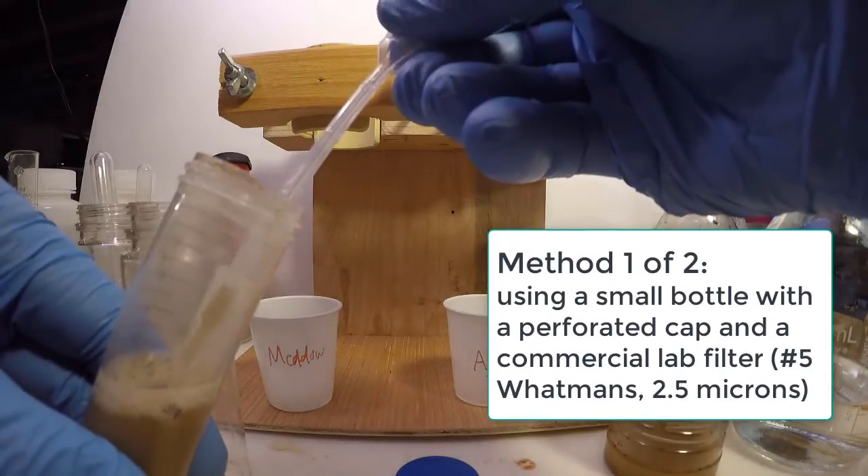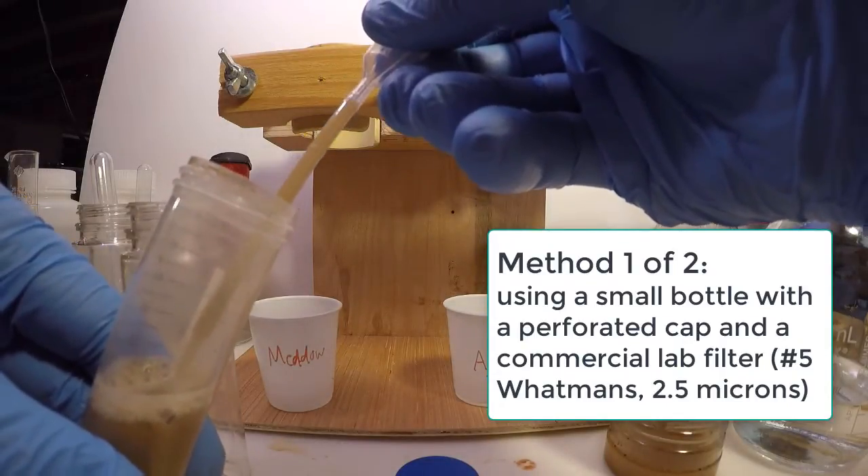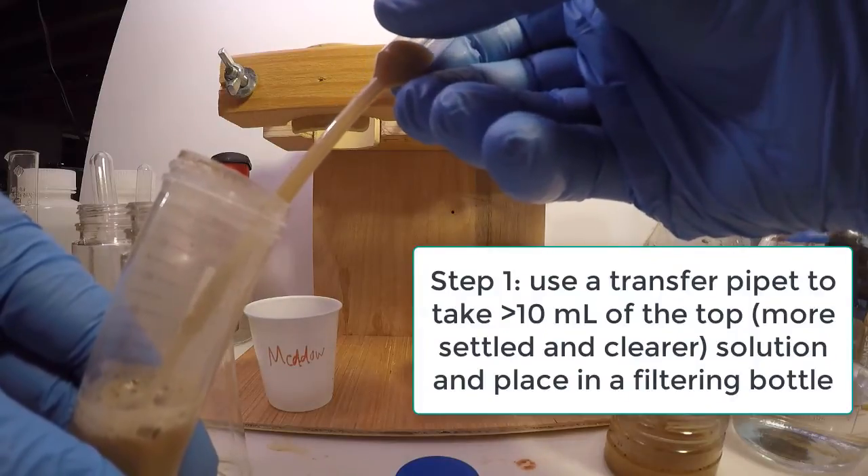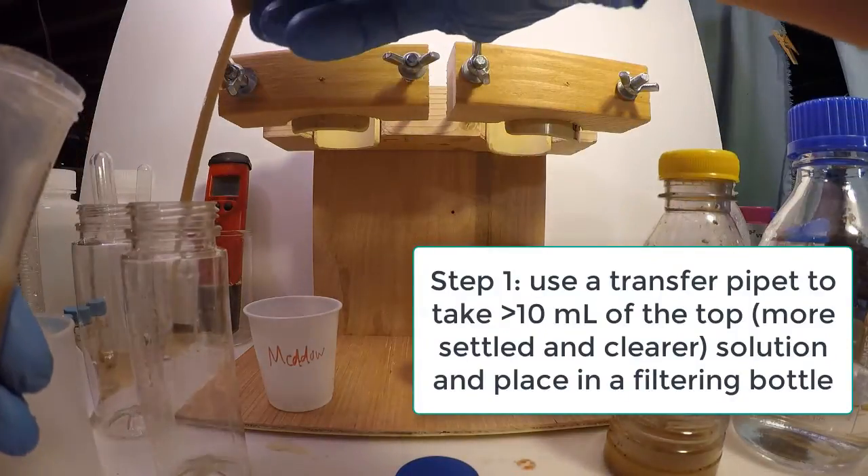To begin the first filtering method, we use a plastic pipette to transfer somewhat more than 10 milliliters of solution from the upper part of the bottle to a second bottle for filtering.